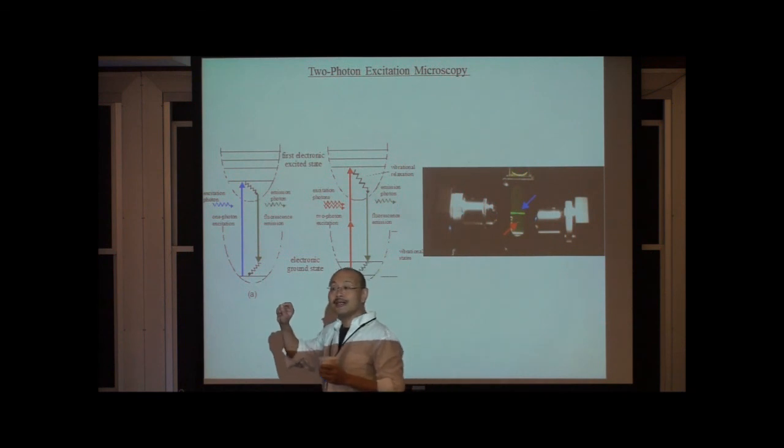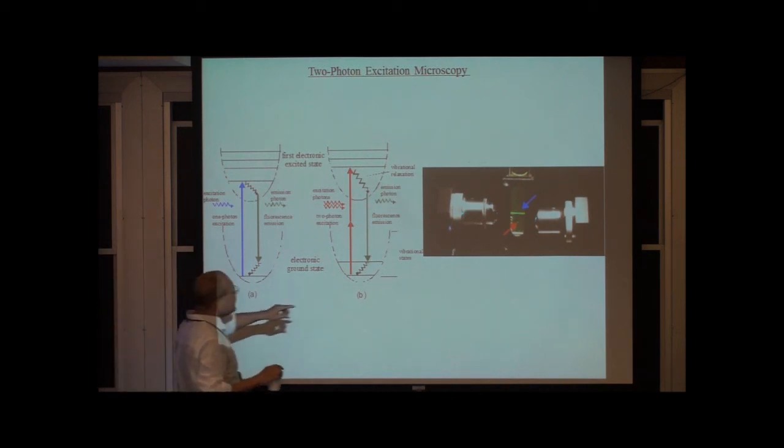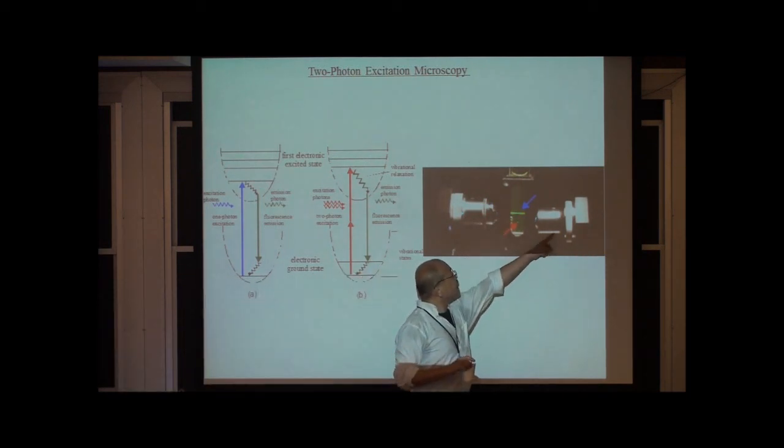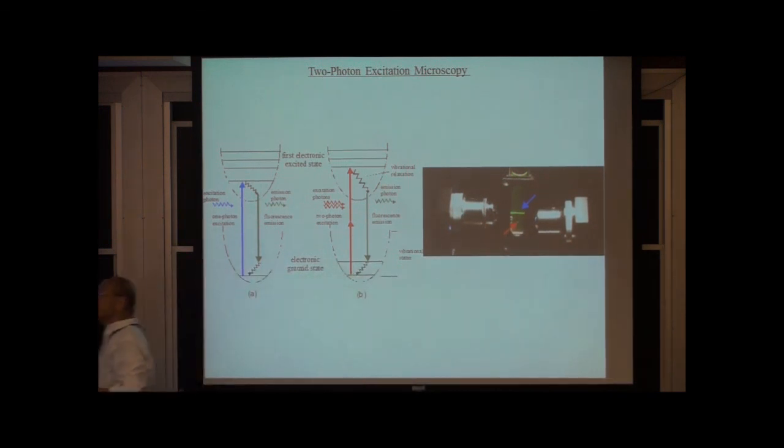So two-photon excitation is a nonlinear process that gives you an inherent three-dimensional resolution. You only generate a teeny spot of fluorescence using a focused infrared light beam. Make sense so far? So, this is the experiment of sending infrared light in. You can see only a small green spot.